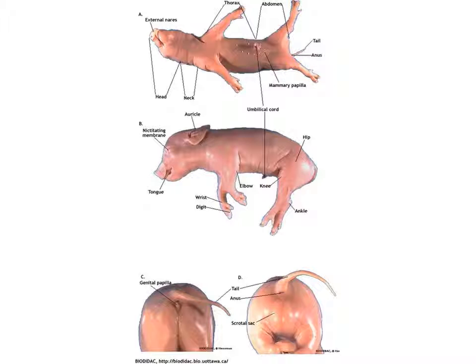Again, I don't think there's anything novel on this, except it's your first look at the genitalia. So the male should bulge out a little bit here. Typically these sacs are not so flush. They're going to be deflated, but you'll see that it's a distinguished area for that. And the ladies have a little finger-like protrusion sticking out. That's the genital papillae. I don't actually know how to say the word, but remember, anything in anatomy that looks even vaguely like a finger is called a papilla, whether it's on the cell, tissue, or an anatomical level.